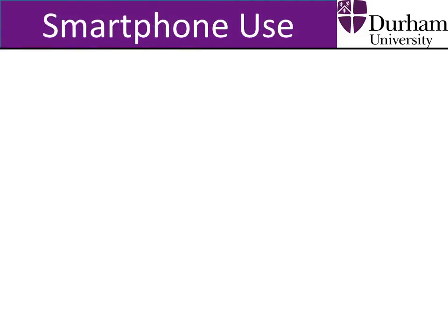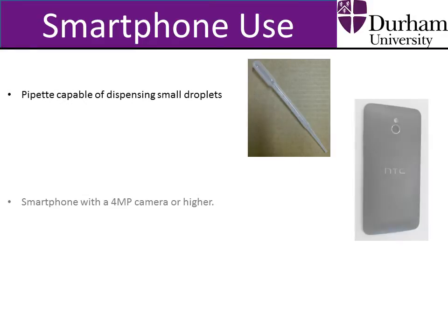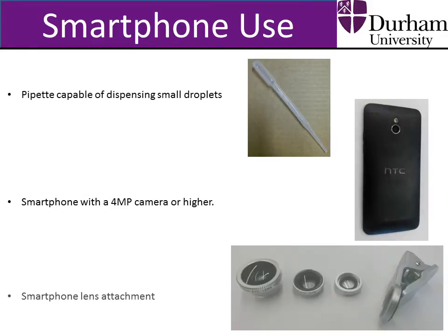In this tutorial, a simple alternative to this system is described that uses a pipette, a smartphone, and a lens attachment to take an image of a droplet. A free image editing software can then be used to calculate the contact angle from the image. This method costs less than 7 dollars and can be carried around in your pocket.